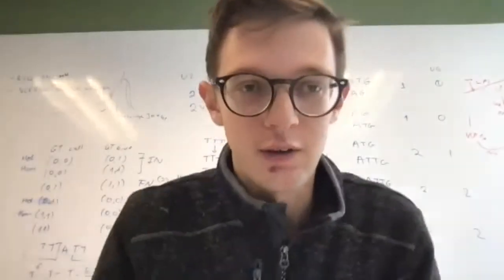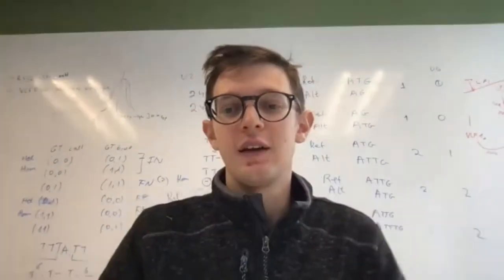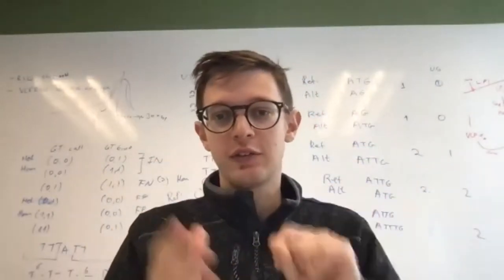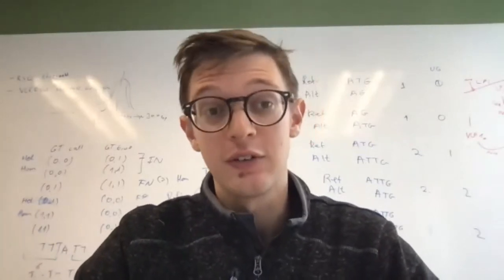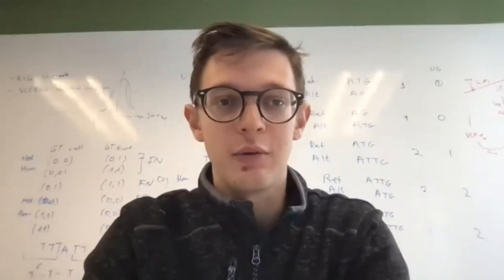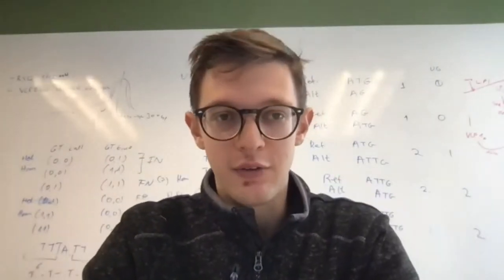Let's see. Maybe just a follow-up clarification, please, Michael. Some of the questions: DRAGEN-GATK is not a whole separate new tool. It's a configuration of existing tools. Maybe just to clarify that with the documentation about haplotype caller that came up. If we run variant calling in DRAGEN-GATK mode, that is basically just another argument that is passed to the haplotype caller task. So everything else, the infrastructure of GATK, remains the same.